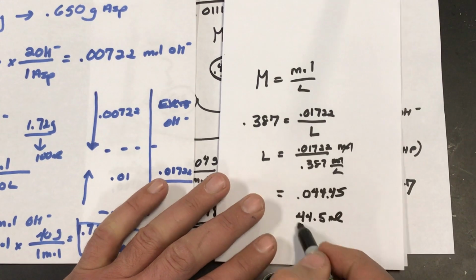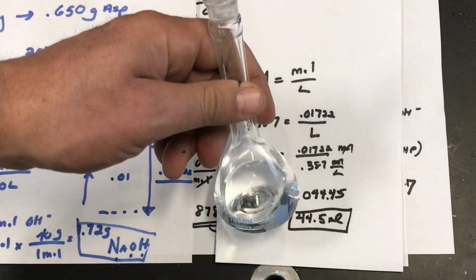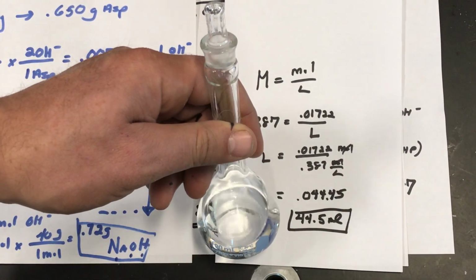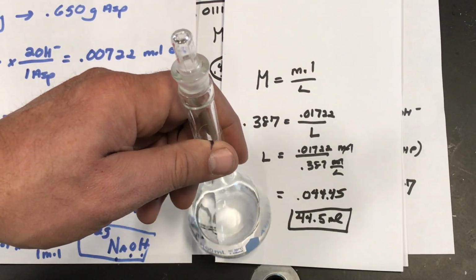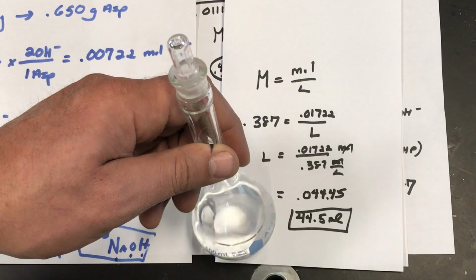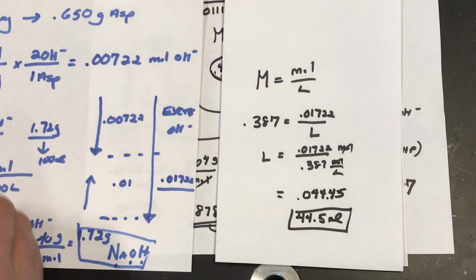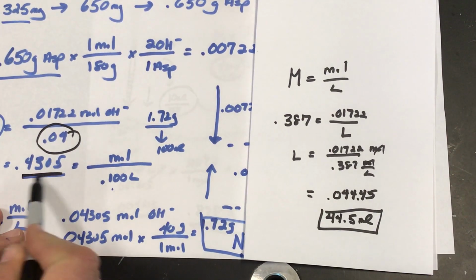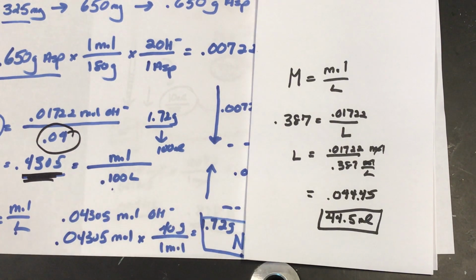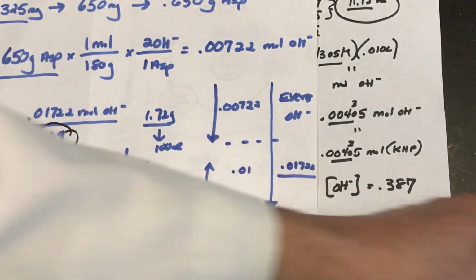milliliters. That's exactly how much of this I need to measure into my what? Beaker of dissolved aspirin that's been heating, okay? It is bigger than the 40 milliliters that we calculated for because we suggested we were going to have that concentration, but by standardizing. So it's really important to standardize. We'd be off by a significant amount there. So we're going to keep that to the side when we do that lab now.